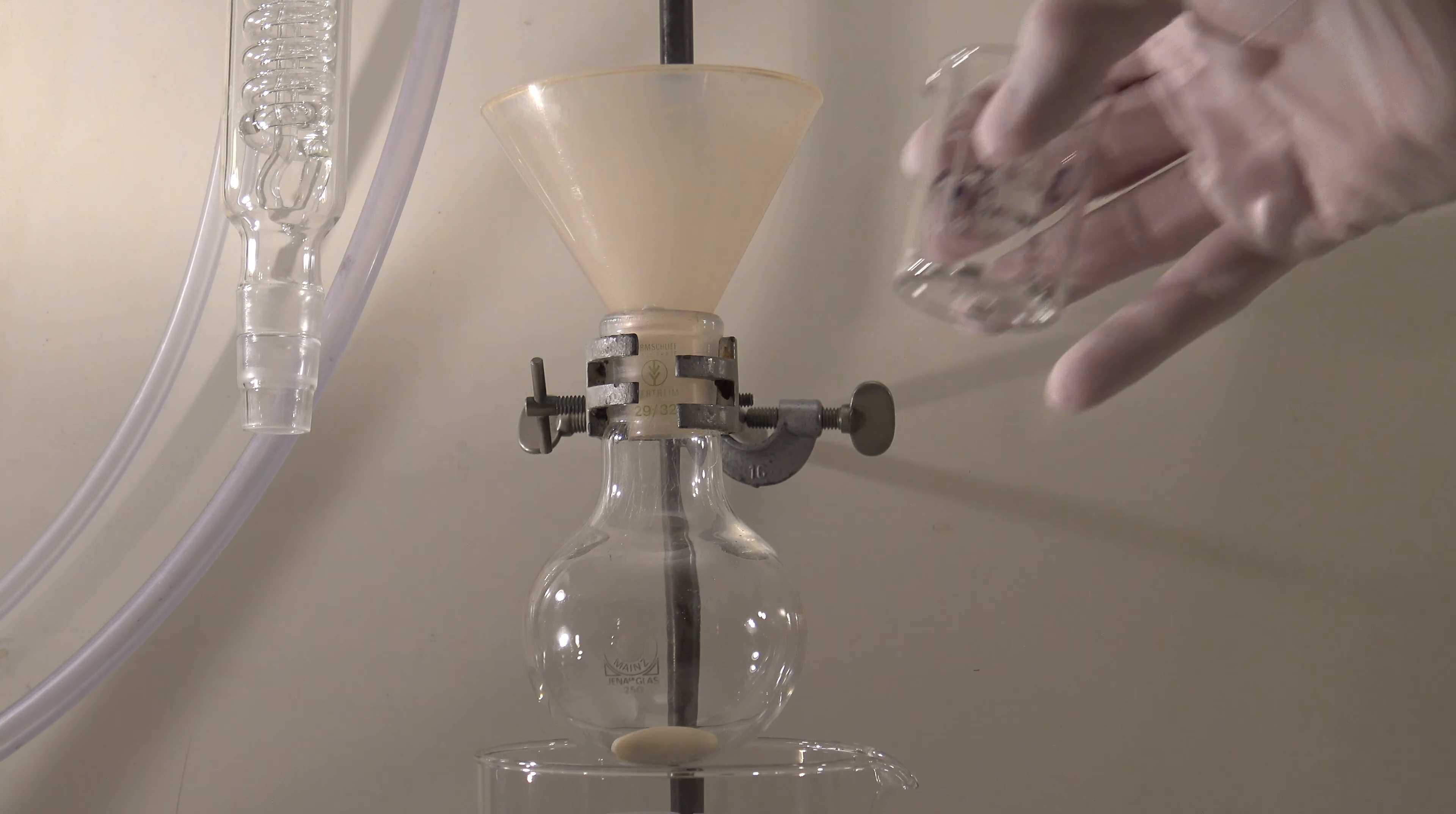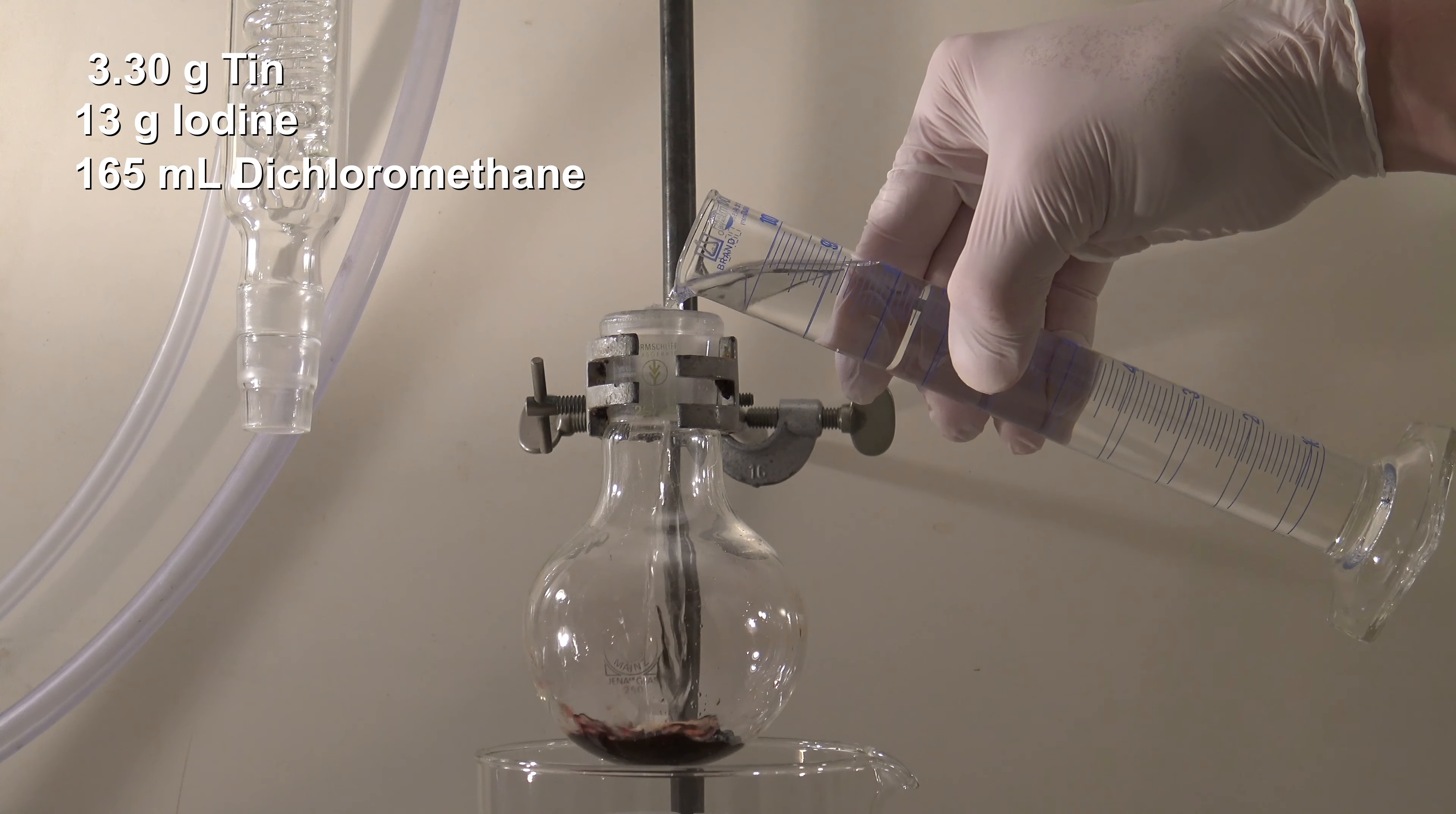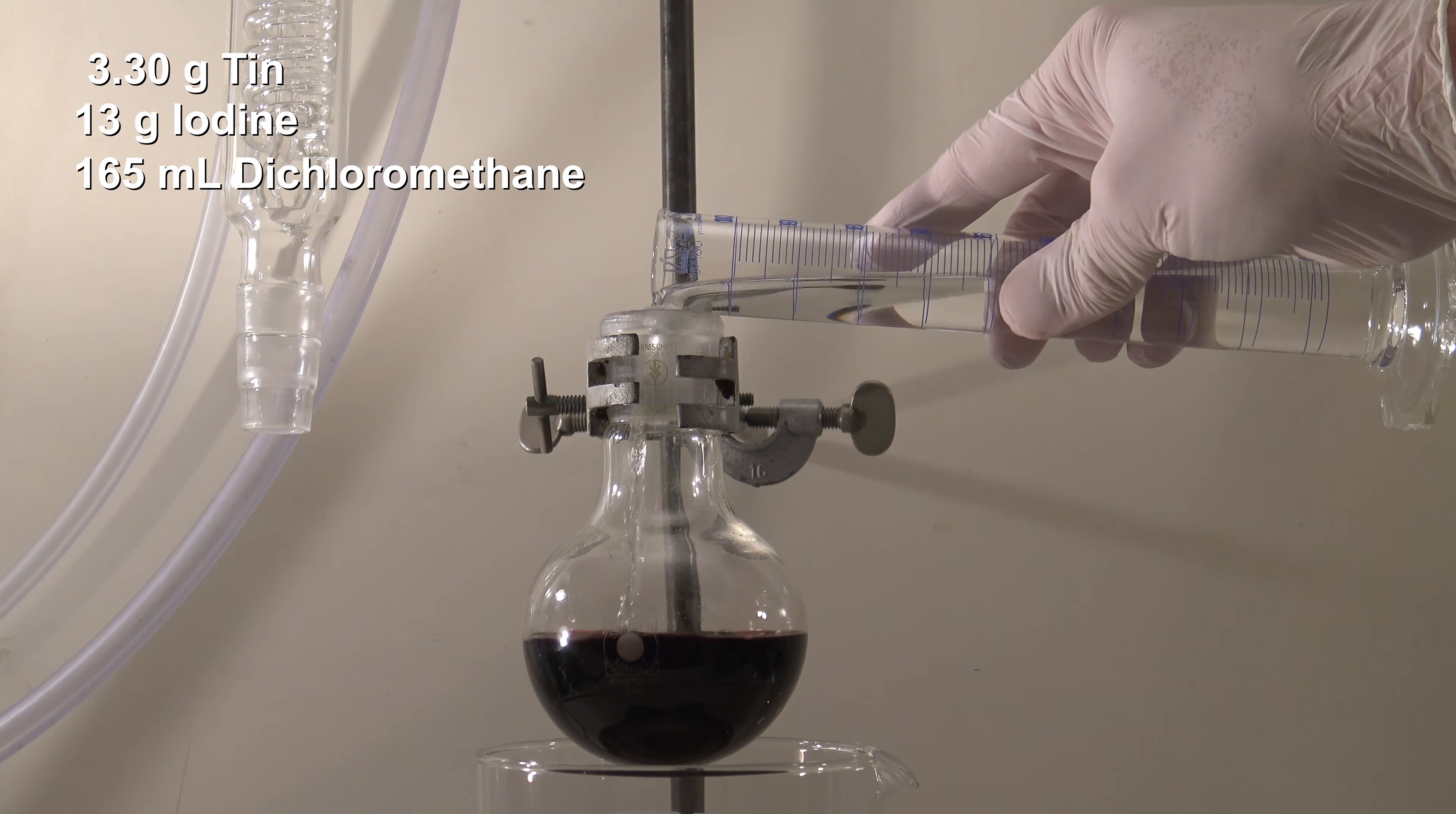To the round bottom flask the following was added: 3.3 grams of tin, 13 grams of iodine, and 165 milliliters of dichloromethane. Then a Dimroth condenser was added and the mixture was heated to reflux with a water bath.